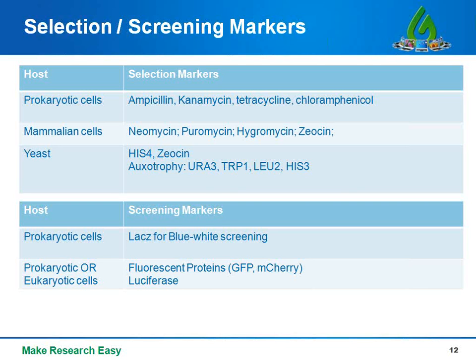In yeast expression platforms, selection is usually performed not with antibiotics, but instead with auxotrophy. So auxotrophy is the inability of an organism to synthesize a particular organic compound required for its growth. So, for example, all yeast will grow on complex media that contains all necessary amino acids, but in order to grow on a medium that is lacking a certain amino acid, the yeast must carry genes that will enable the biosynthesis of that missing amino acid.